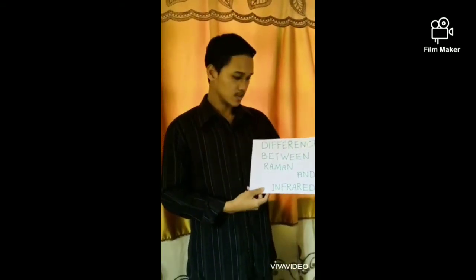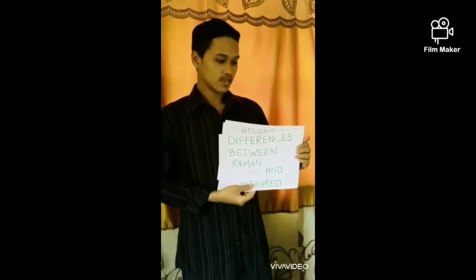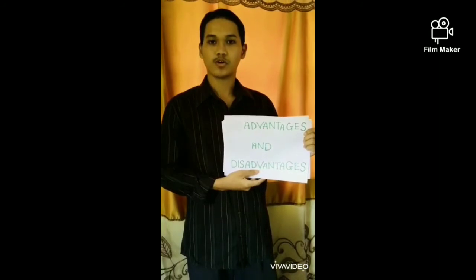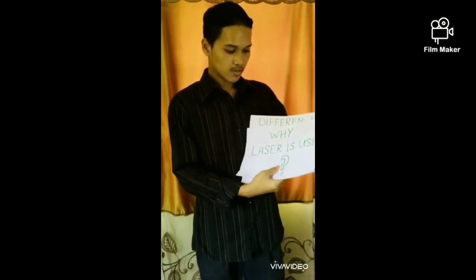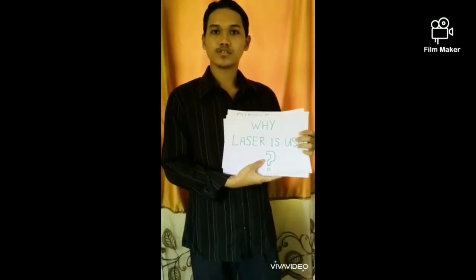Today I would like to explain about laser Raman spectroscopy. In this topic, we want to highlight some points about laser Raman spectroscopy. Firstly, we want to explain the difference between Raman and infrared spectroscopy. Secondly, we want to discuss the advantages and disadvantages of laser Raman spectroscopy. Thirdly, why is the laser used in laser Raman spectroscopy?